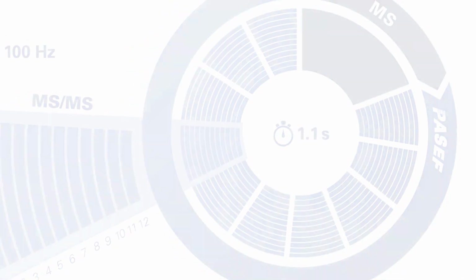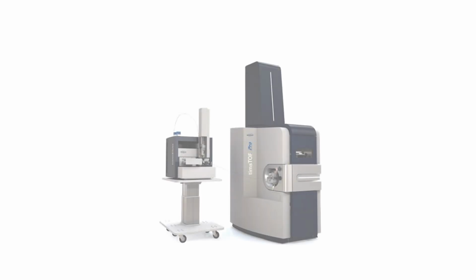timsTOF Pro is a novel type of instrumentation that is based on a traditional QTOF architecture, but in addition has a trapped ion mobility device in front of the traditional QTOF architecture. And this allows us to do two things.